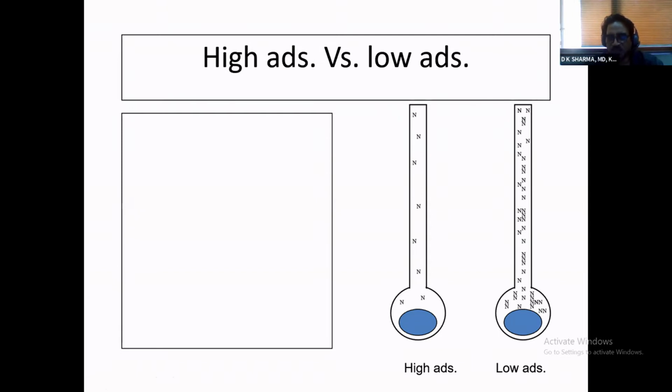There won't be any measurable adsorption, because all the gas that you sent remains above the sample with very few molecules adsorbed, and that is not a very good calculation.